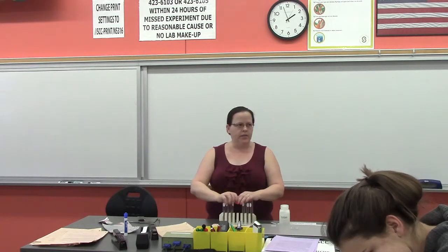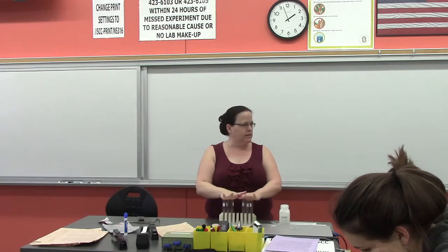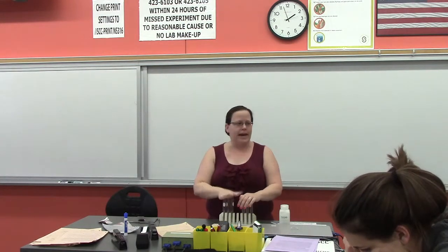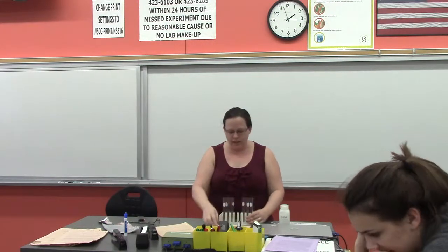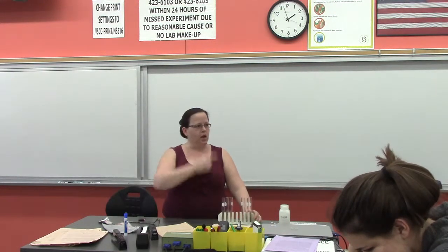Then make your observations. So you're going to put all the liquids in, you're going to mix them up, you're going to bring them back, you're just going to let them sit for a couple of minutes. Maybe while you're answering some other questions. Then once they've sat, then make your observations. So it says, are they miscible? Miscible means the 2 liquids dissolve in one another.